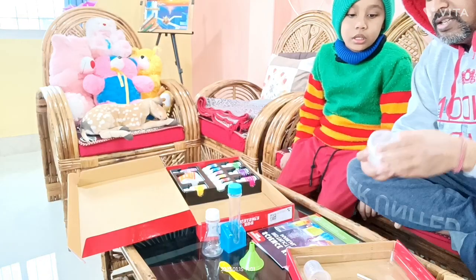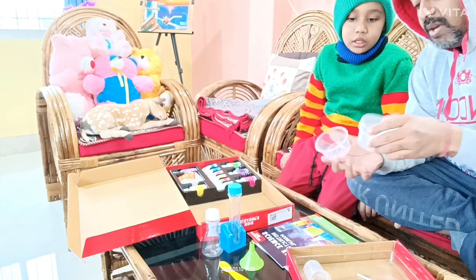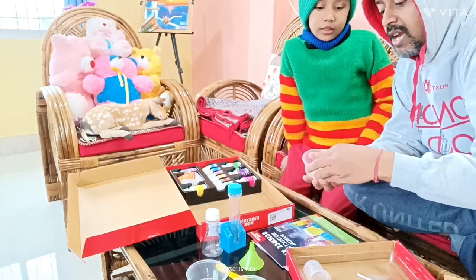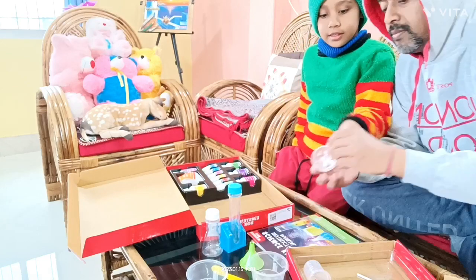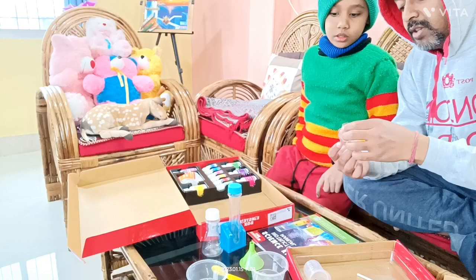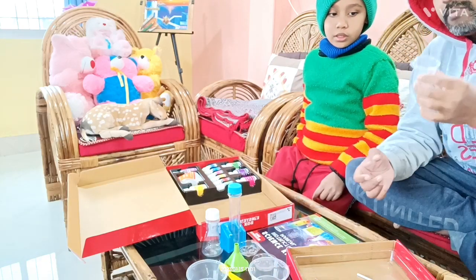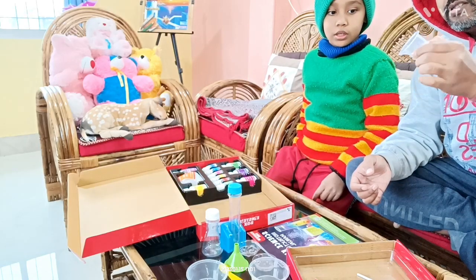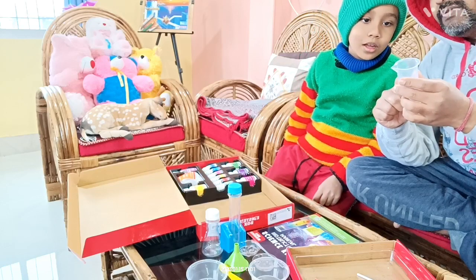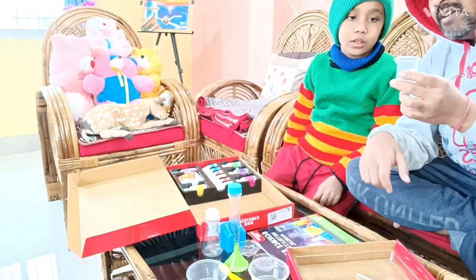And put the chemicals in the test tube. These are beakers — a kind of container to hold items. These are small petri dishes. And this is a measuring flask or measuring beaker — a bigger one. You can see the quantities and capacity written here: 5 ml, 10 ml, 15 ml, 20 ml, and 25 ml.